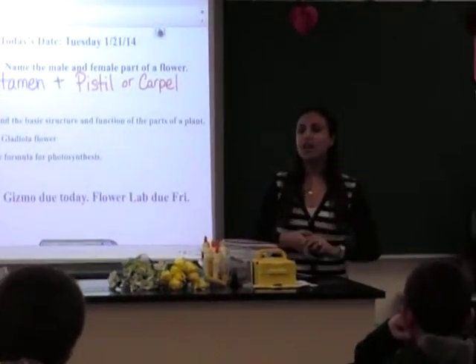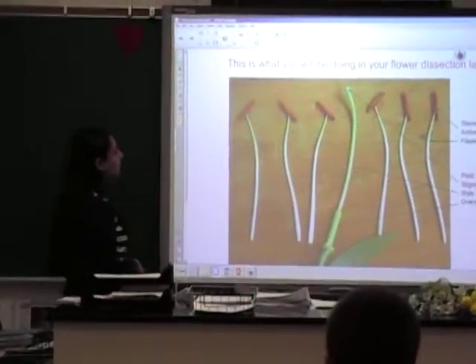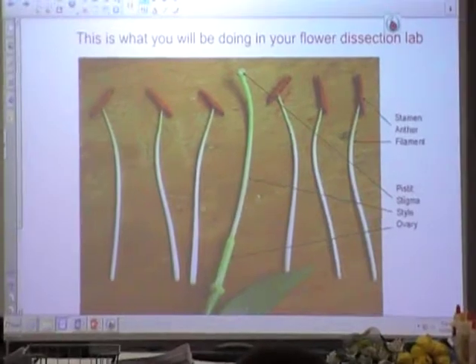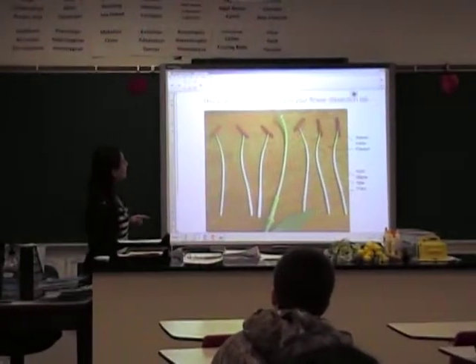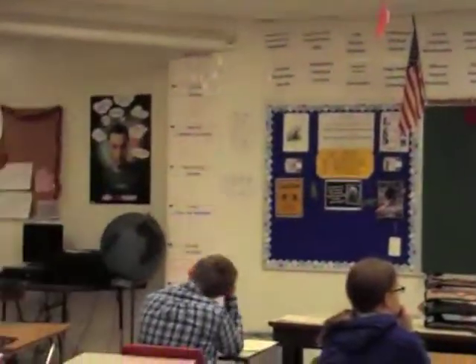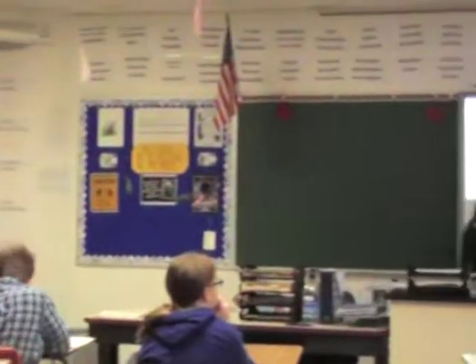All right, let's start with a little bit of review. So this is kind of like what we're going to be doing in our lab today. Daquan, would you mind hitting one of the lights, please? Get a better contrast. So this is what you're going to be doing. Now they won't look exactly like this because this is a different flower. I believe this is from a lily. But essentially the same parts.